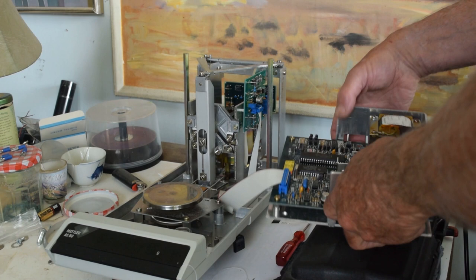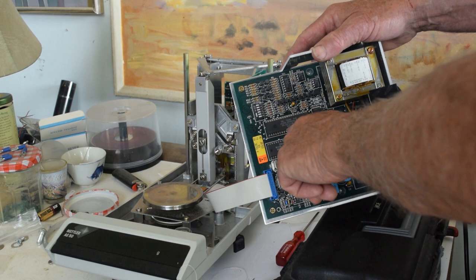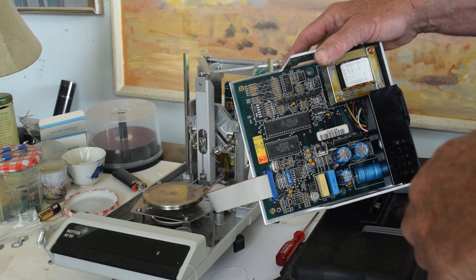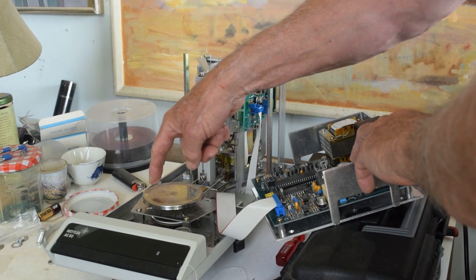I think what happened was that Mettler set this up with an accelerometer in it that measured acceleration — probably here, or maybe one of these chips measures the acceleration. If the acceleration is exceeded by some amount, it means the balance has probably gotten damaged, like when this heavy object came down.